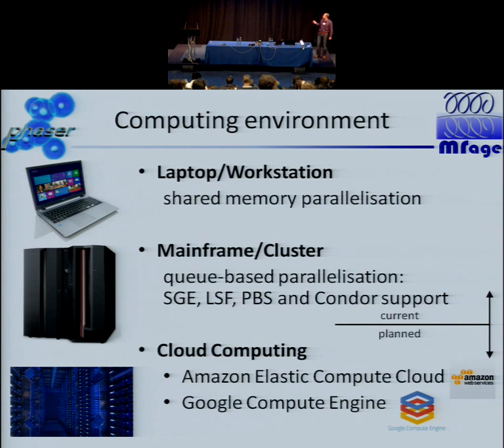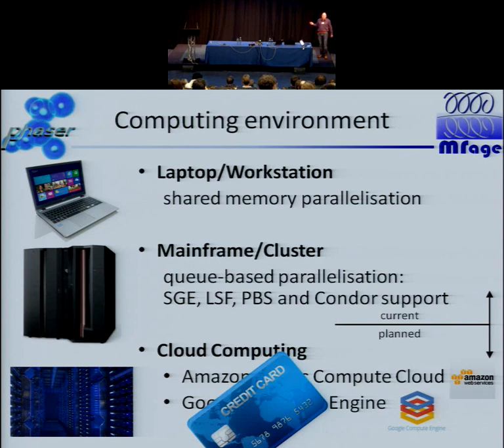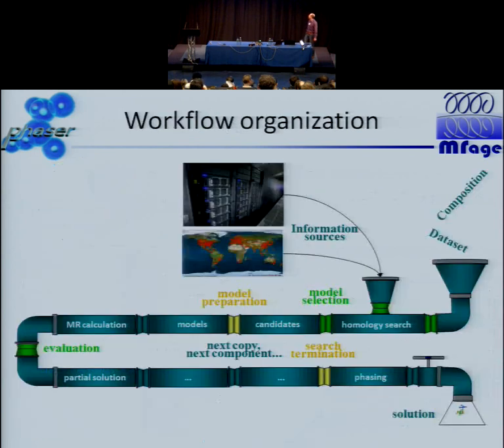And if you have software that creates this virtual cloud, or virtual cluster, in principle you can just run your calculation in the cloud. Anyway, whatever the situation is, one important thing is that a credit card number is going to be an important parameter for molecular replacement searches. And in fact, I will also need one from Randy, just to allow me to implement this.